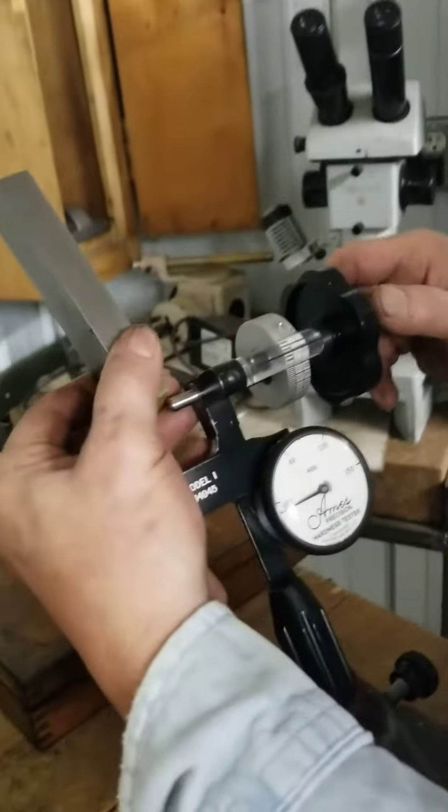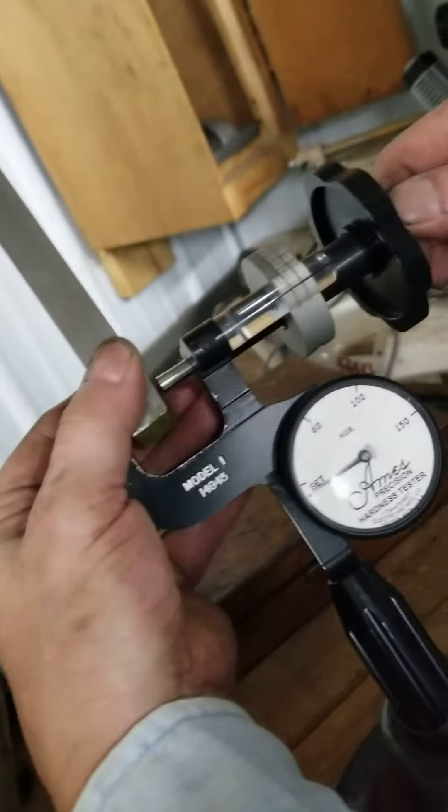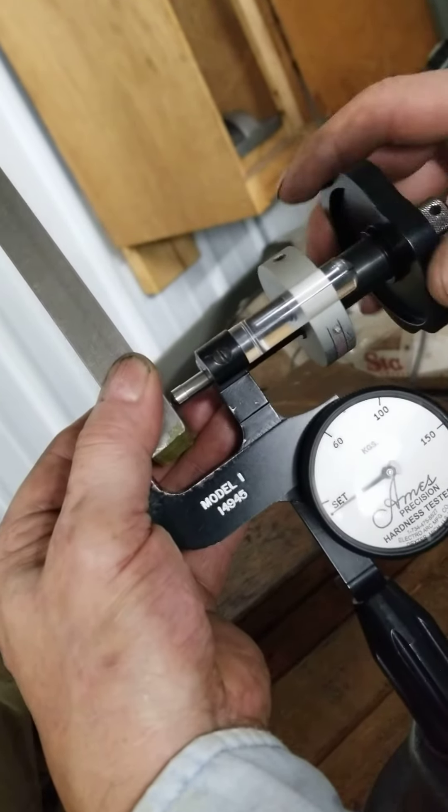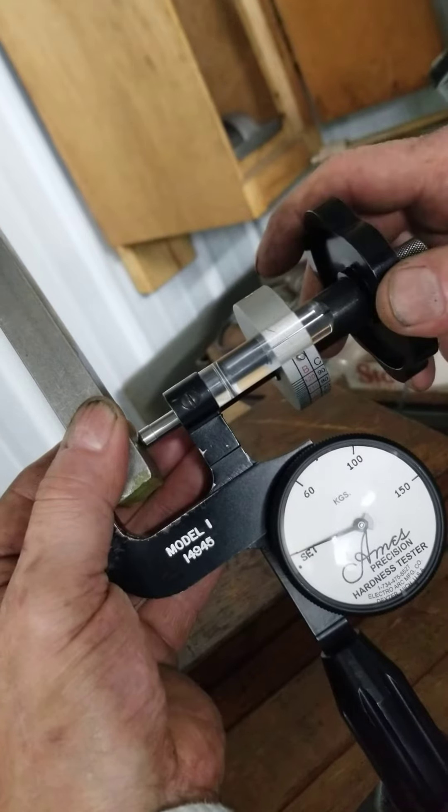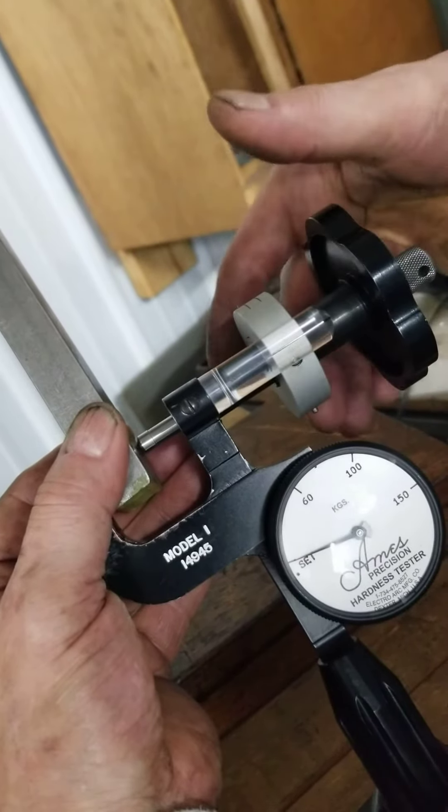You place the piece of steel into the throat of the tester and apply your minor load, which is the set line. You have to hit right on the lines.